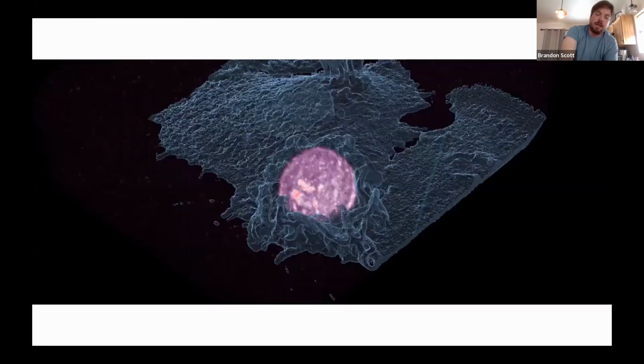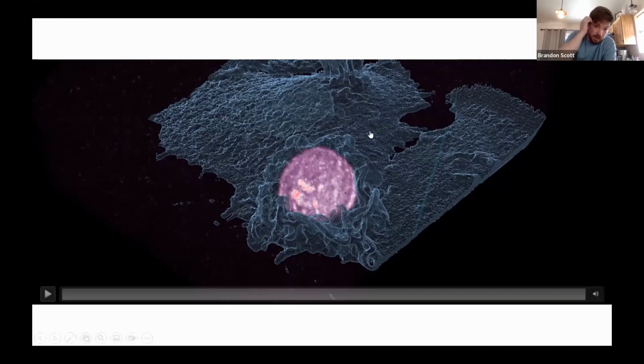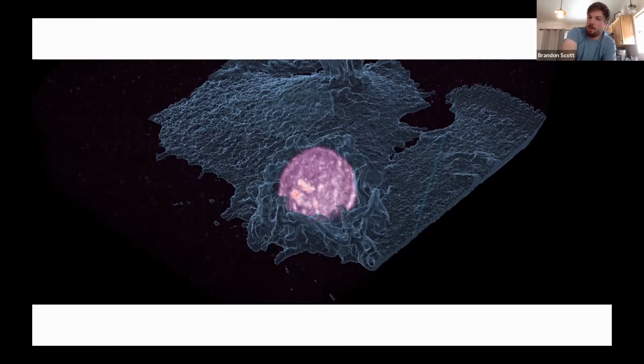Right, so what does that look like? Here's now a movie that we've rendered in 2 ways, showing a target cell that is going to be internalized by our macrophage. This is all done now in Chimera, which is what we're going to talk about for the rest of it: different ways to visualize the data first, and then our efforts to quantify those data.